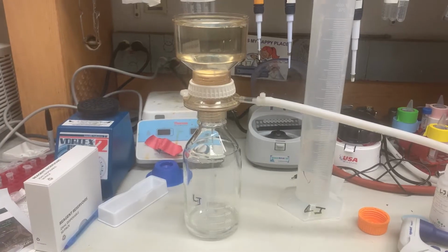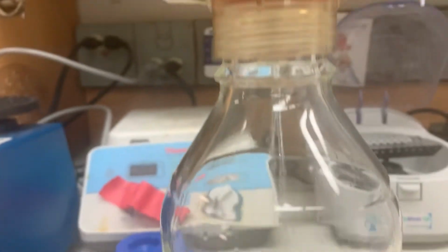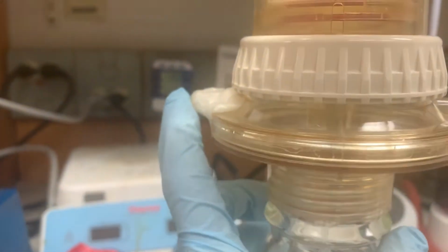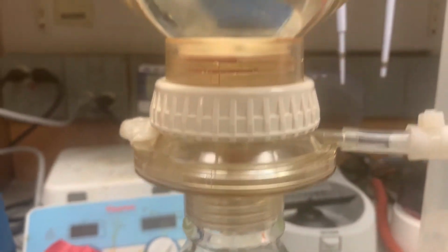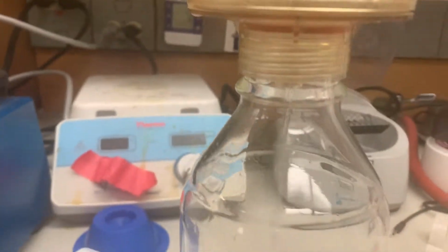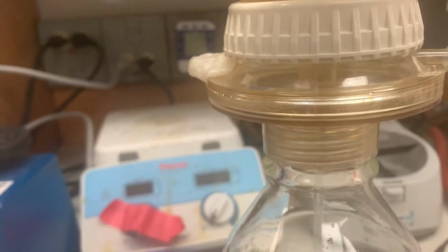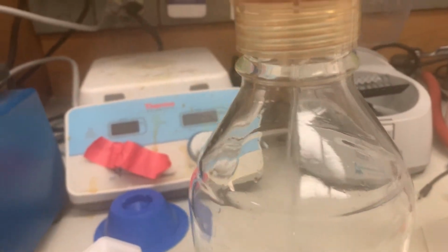So you can see that the liquid is flowing through the filter nice and slow. So I have a nice seal here, thanks to the parafilm. So there should be a stopper here, but those things come off all the time. But yeah, if this wasn't tight, the water would be flowing all out of here. So that's why I usually pour a little in first to test that you have a good vacuum seal. Then you should get a nice flow through.